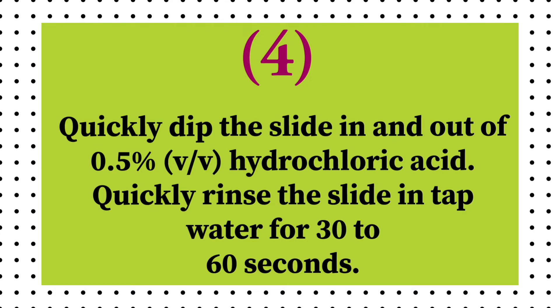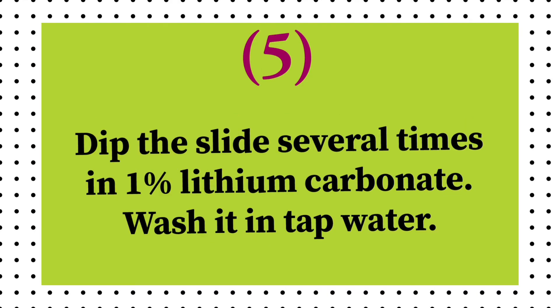Quickly dip the slide in and out of 0.5% v/v hydrochloric acid. Quickly rinse the slide in tap water for 30 to 60 seconds. Dip the slide several times in 1% lithium carbonate. Wash it in tap water.